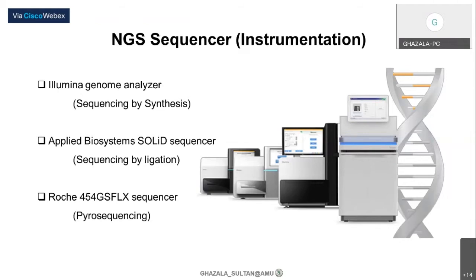Inside NGS there are different sequencers also. We can see a few of the sequencers listed here: Illumina Genome Analyzer, Applied Biosystems SOLiD sequencer, and Roche 454. You might be aware of these sequencing methods, as we already had one session earlier for the introduction of NGS, so you might be aware of the theoretical section of NGS, like how the sequencing is done.